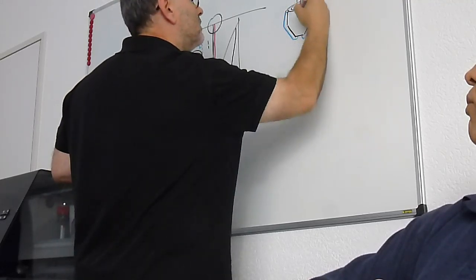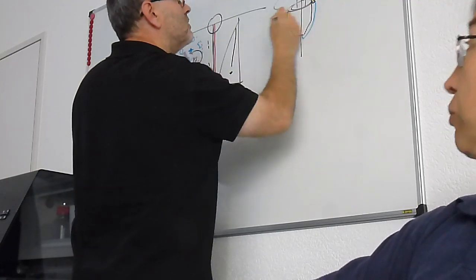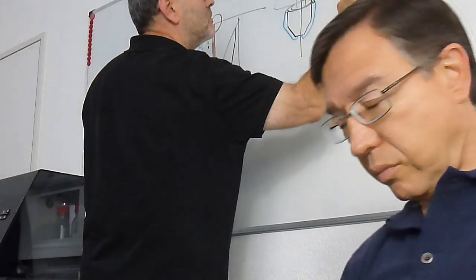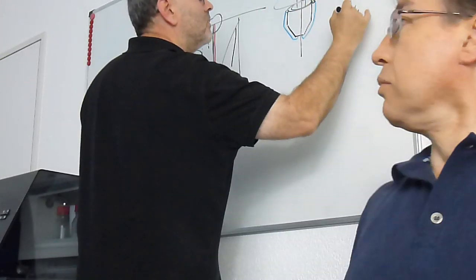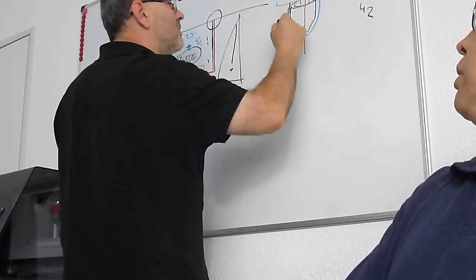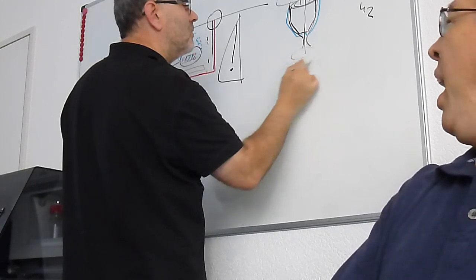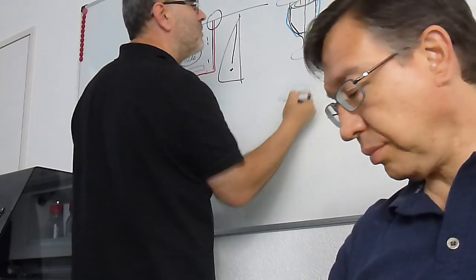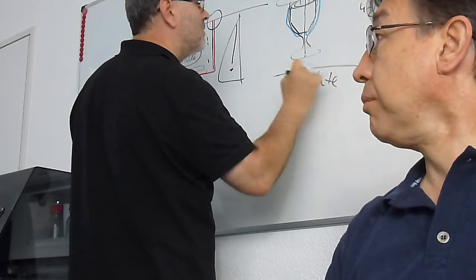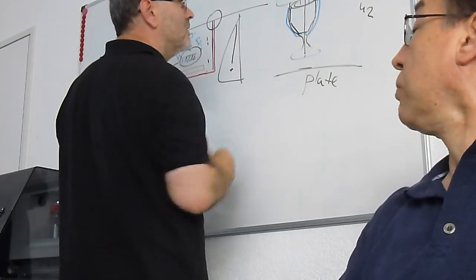And here this is the needle. And if it's connected, we have the special holder with the blue or black tube. That means this is blowing inside and produces a special drop, and here's the spray plate. It produces a special spray application, like a paintbrush.